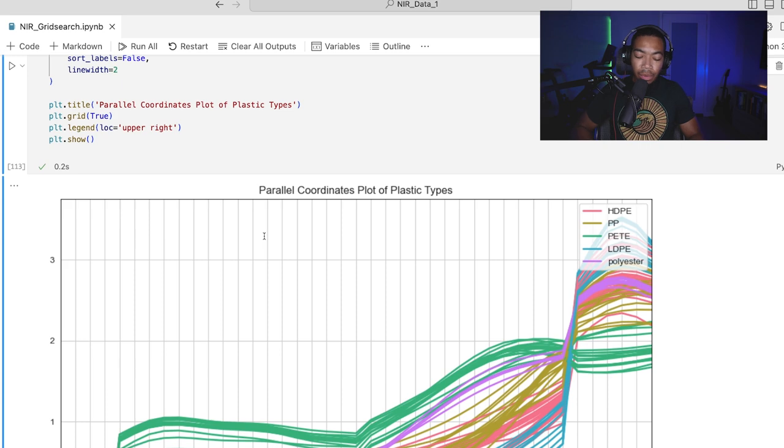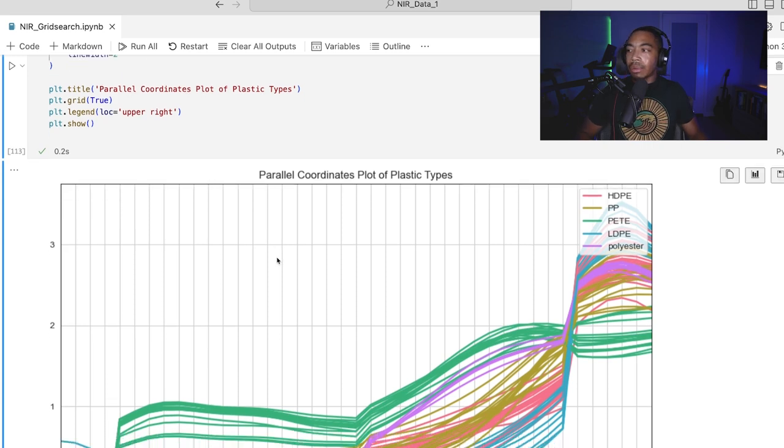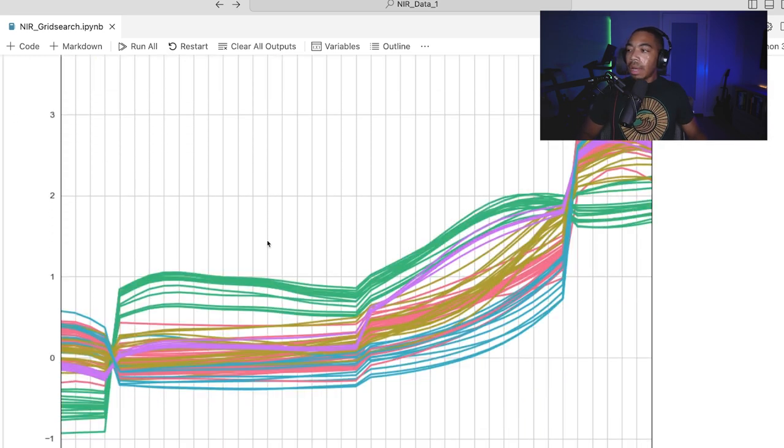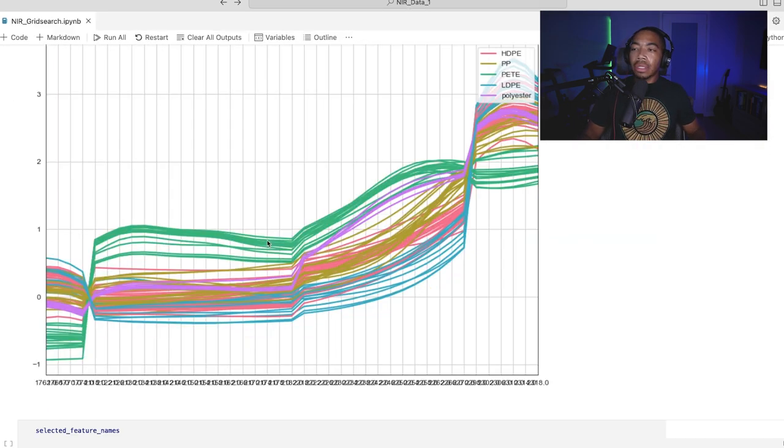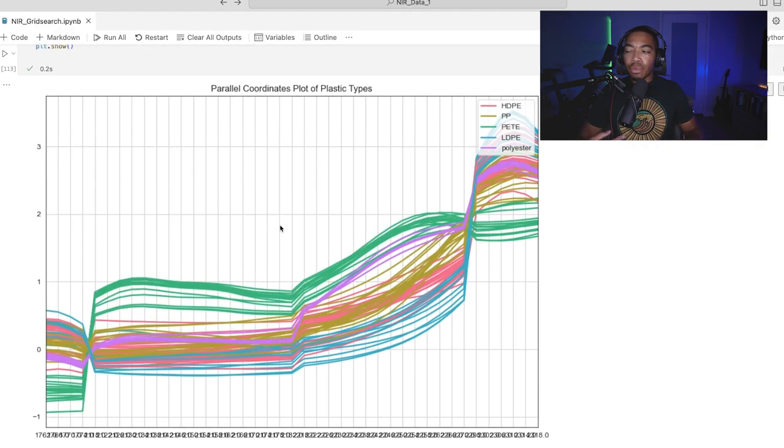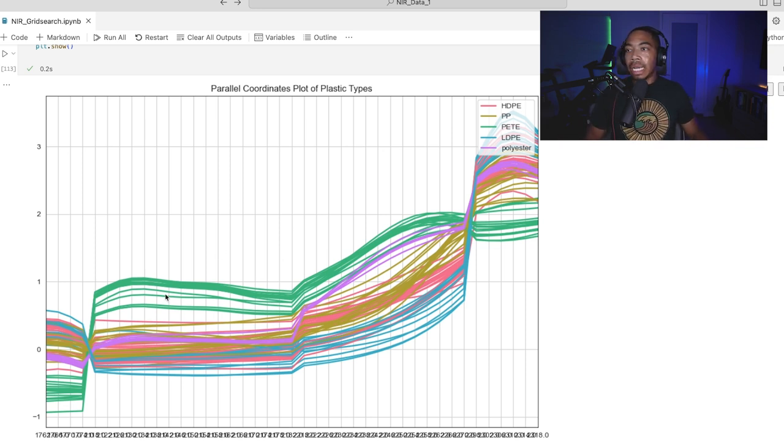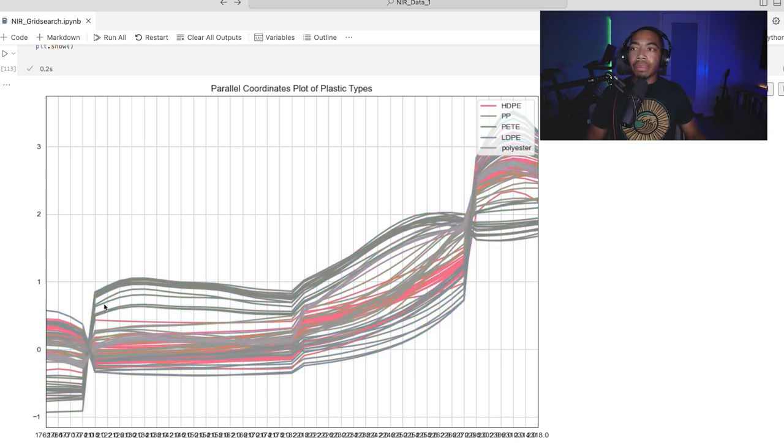And so when we do this, and I zoom out a little bit, you can see that we have what looks like a rough, poorly resolved spectrum, or set of spectra for our data. And so what I'm coloring by the plastic type, so this pink color is high density polyethylene.